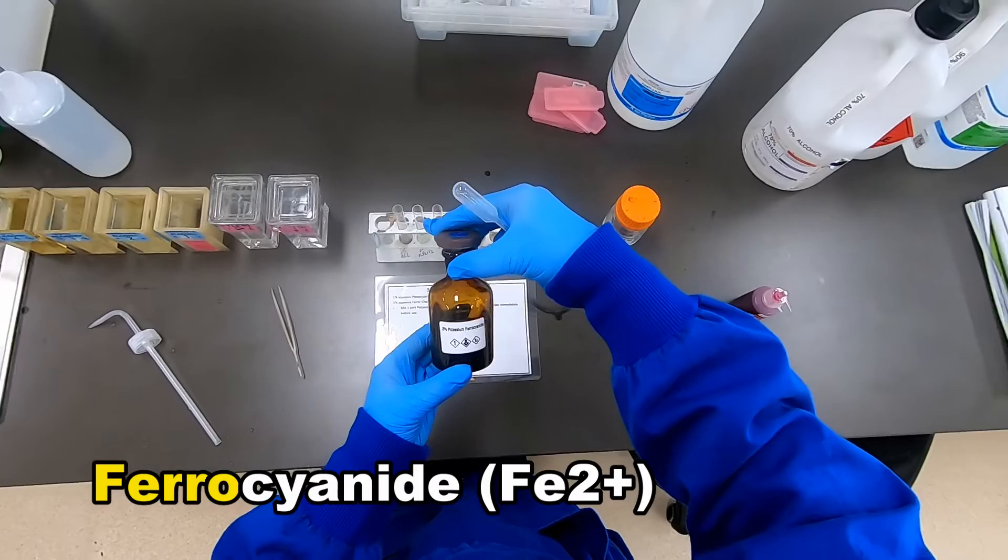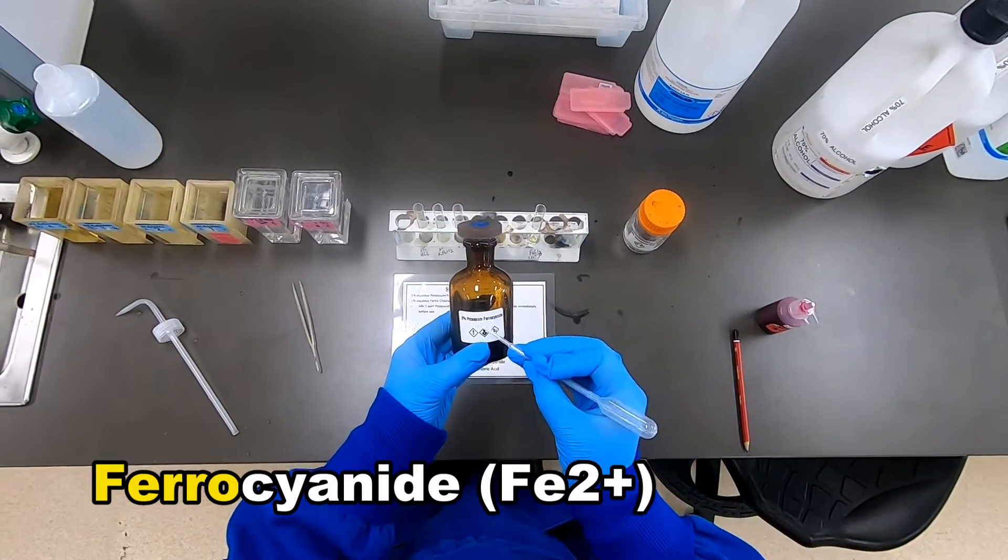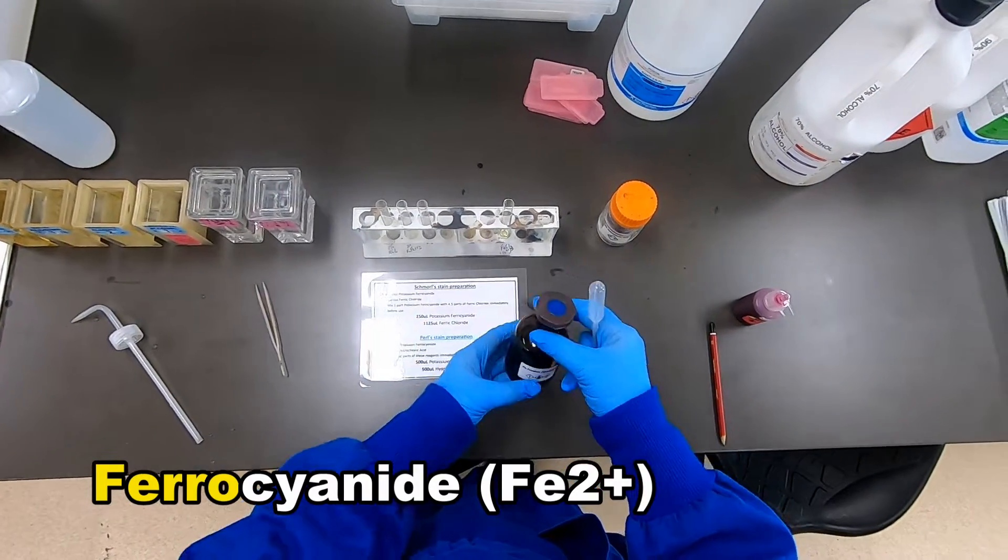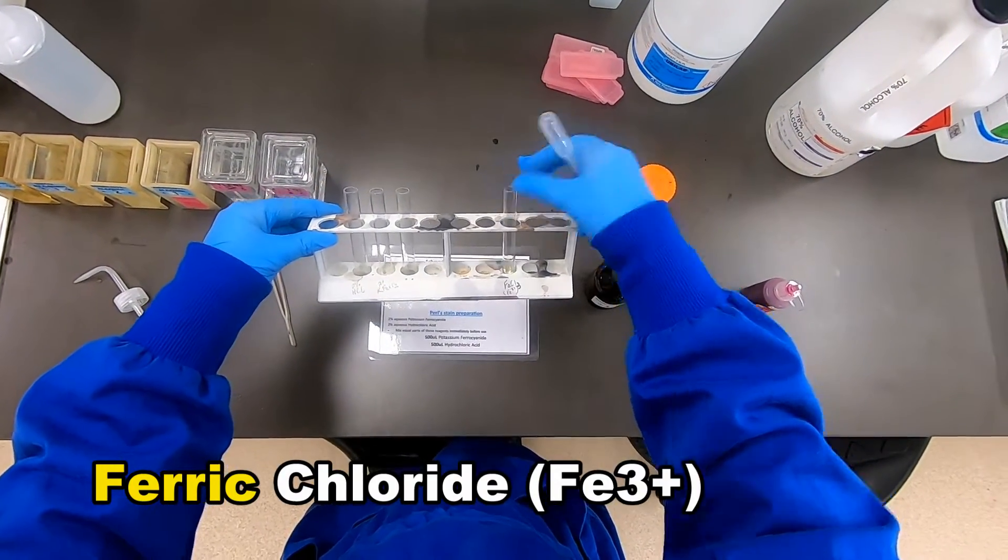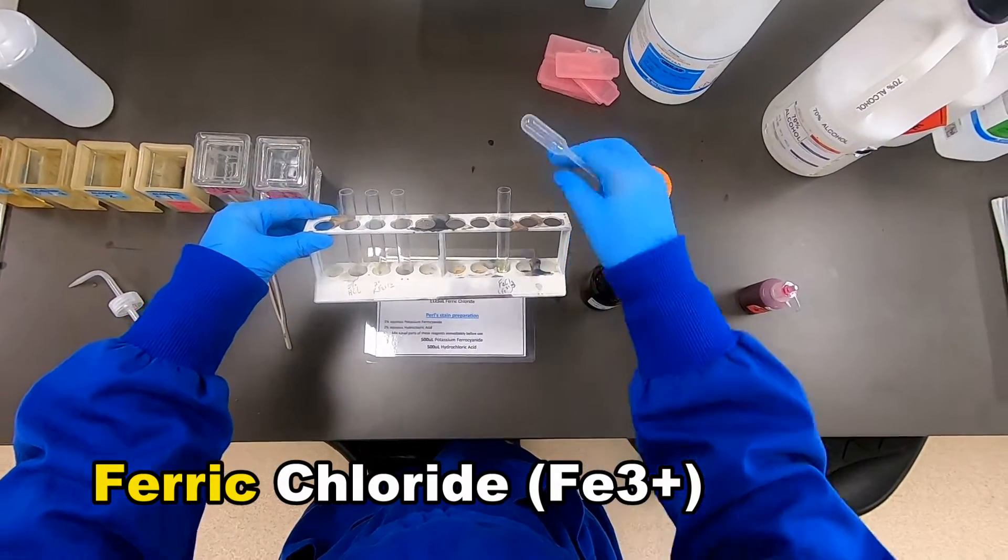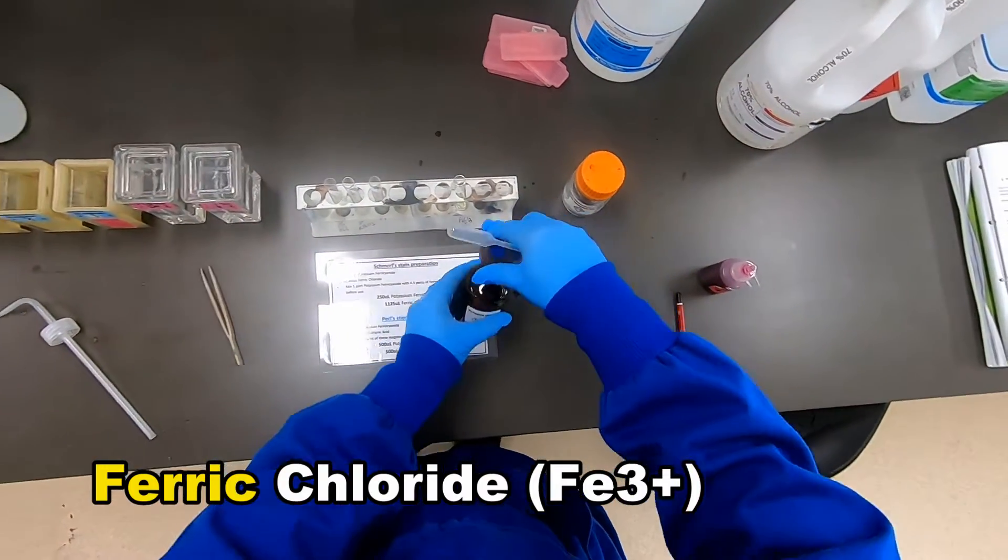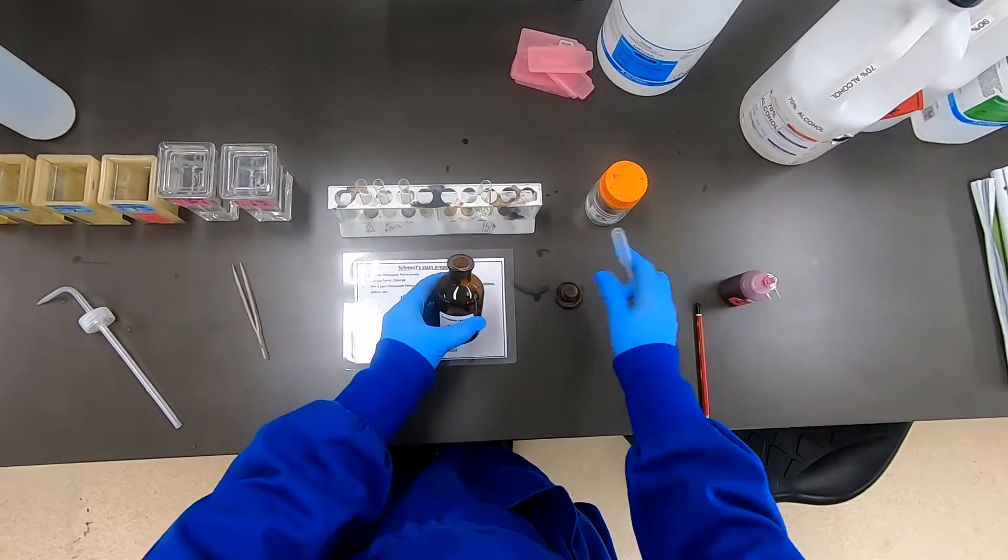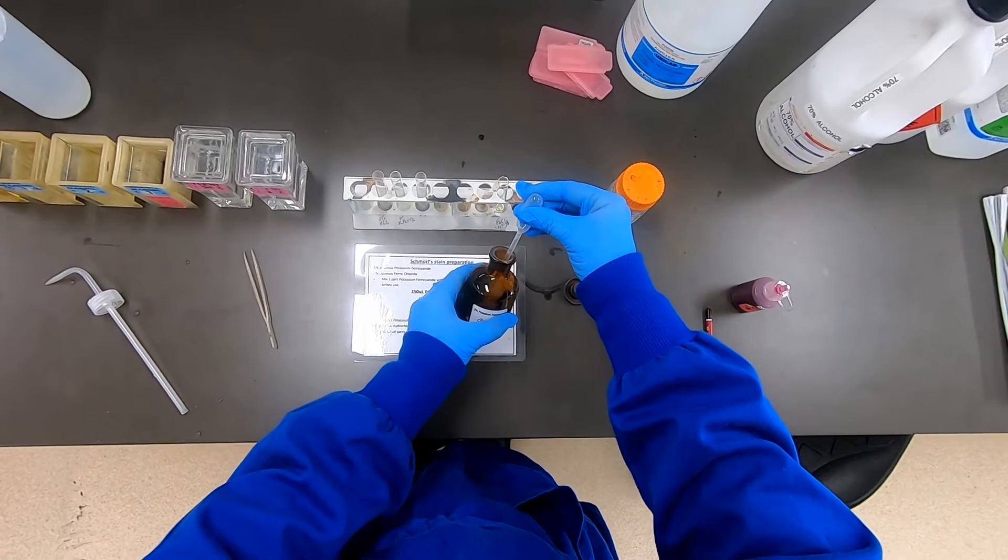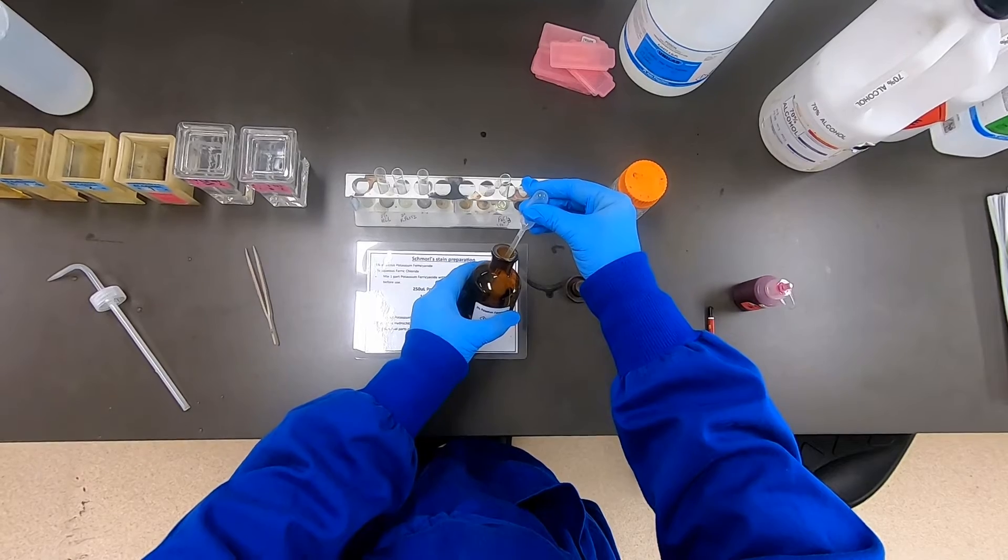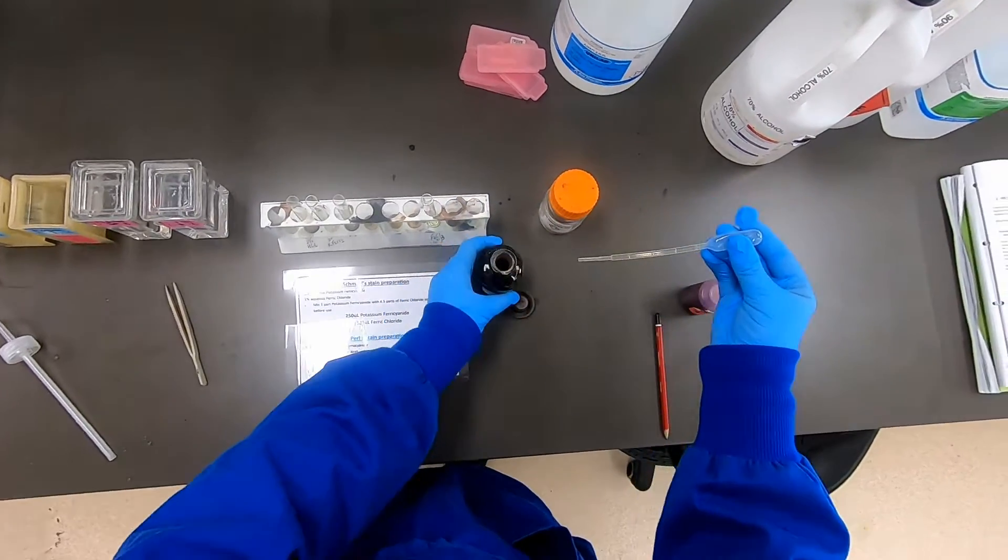Once those slides are staining, we can do a demonstration using test tubes as to what's actually going on here. If we take a solution of ferric ions in solution—of course these would naturally come from the tissue—and we apply potassium ferrocyanide.